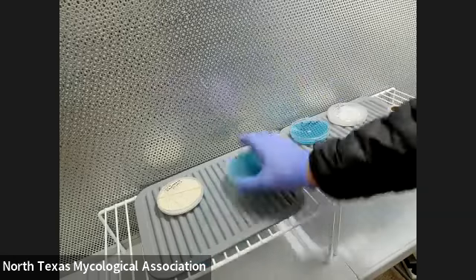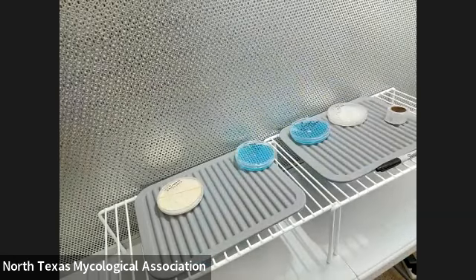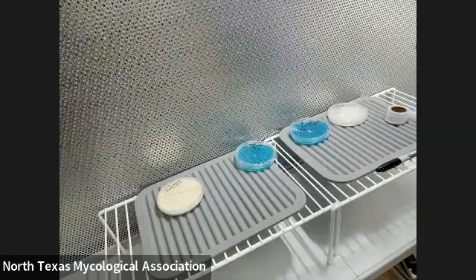The main thing is they're not going to get it perfect the first time they do it. But hopefully they get something to take off and see if they contaminate their stuff. That's really exciting for them, I guess.